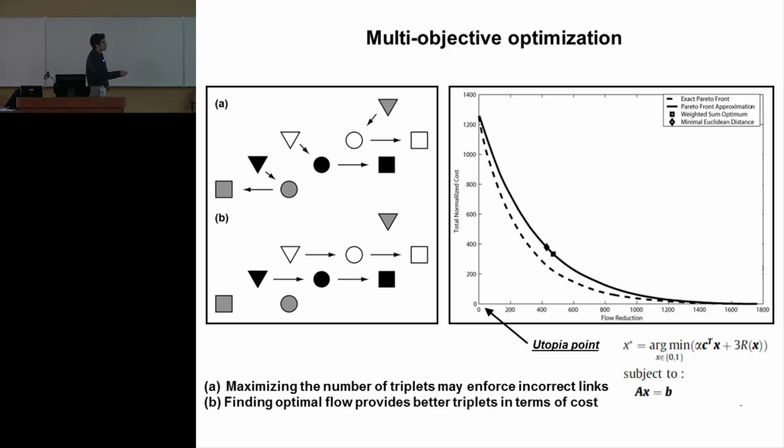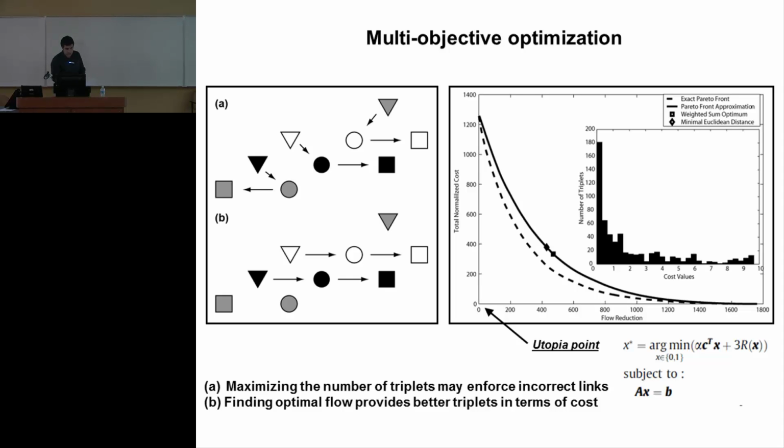Correct. Okay. So here, for example, from flow 3, we go to flow 2. It could be 1 and 0. And then for every scenario, we sum up the cost. And then, in order to approximate that, what I looked at was the distribution for one solution of all the costs. So that's the maximum mean cost. And then I created a cutoff where the cost started having large numbers, and then enforced this on the flow. So instead of having, let's say, a flow of 1,000, I would have a flow of 700, 800.